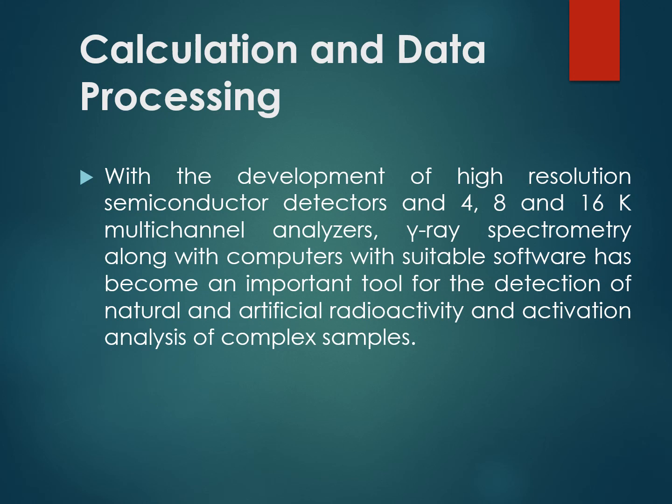There are different multi-channel analyzers that are being discovered, or being used in different ways, to enhance the sensitivity of a particular instrumentation or particular detection.